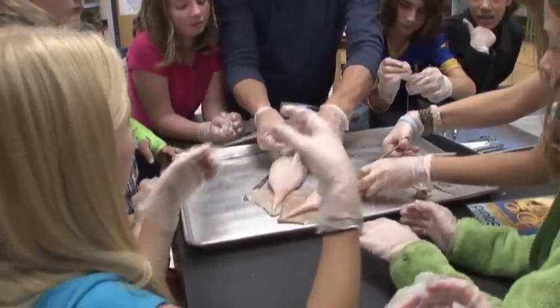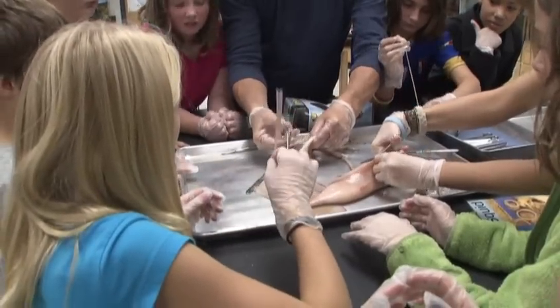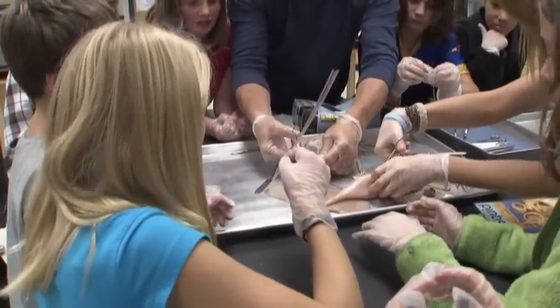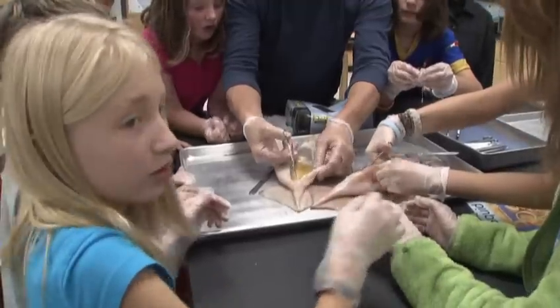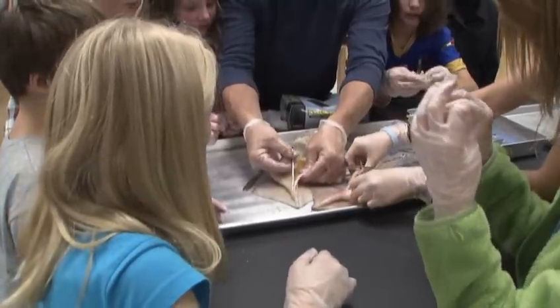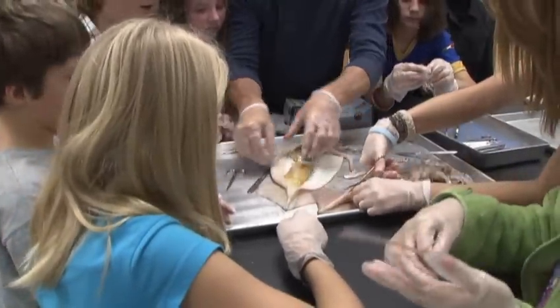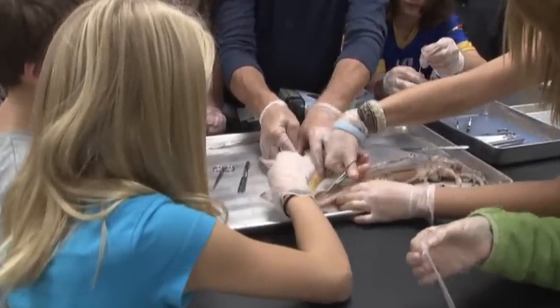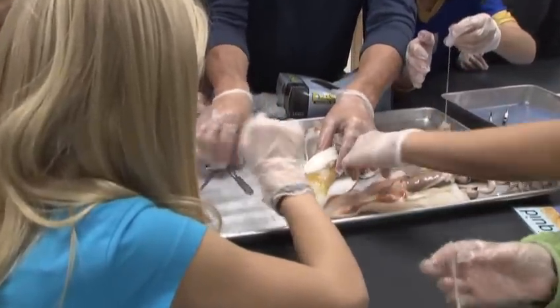They're mostly the digestive gland and things to make babies with. I thought you said you thought it was a male. Once I thought it was a female. It looks like mother of pearl. Well, I cut this a little off center, but look, it's like a bone. Yeah, it looks like a pen. Get it? Here's what I want you to see, look.